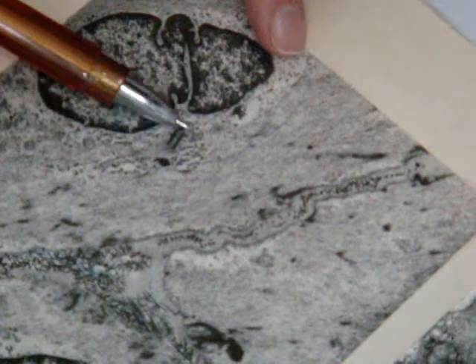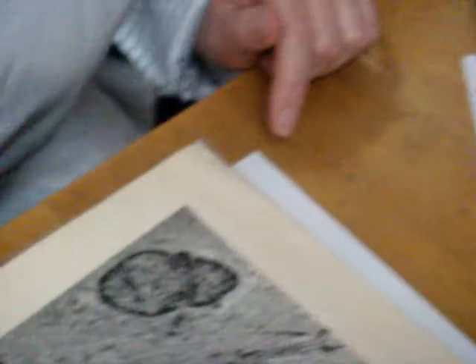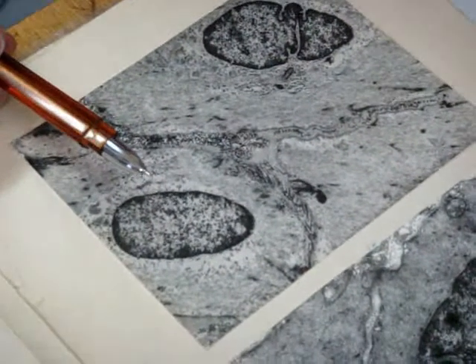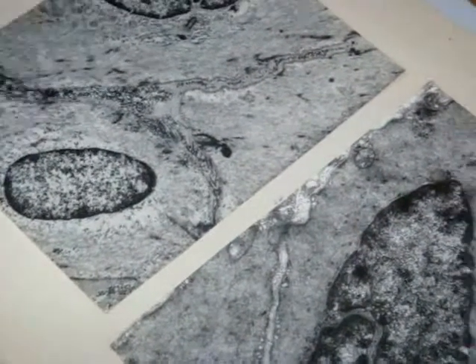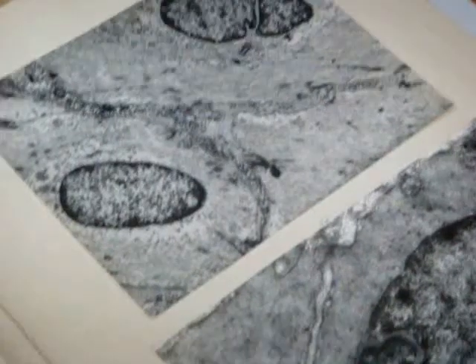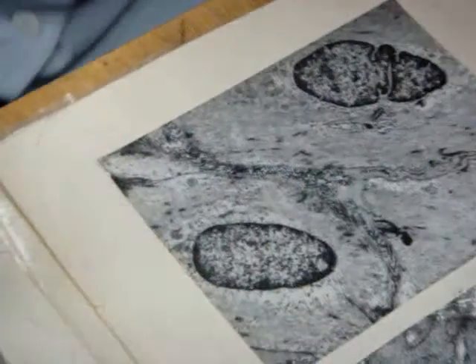Near the nucleus, we can see a lot of organelles: rough endoplasmic reticulum, centriole, mitochondria, and all this cytoplasm is filled with actin. Myosin is also present, but it's not visible. Why? Because it has a special structure. Do you remember? The process of activation, initiation of contraction, is connected with changing the shape of the light myosin, not the heavy, from curved to straight.